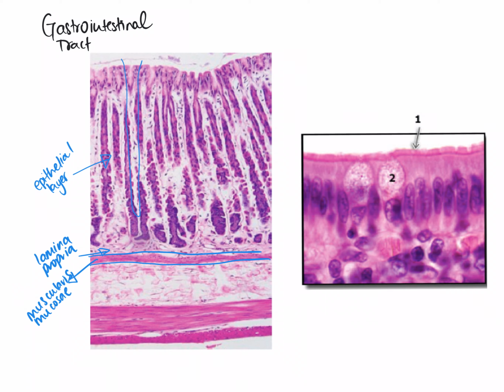Moving on from there, we've then got the submucosa, the paler layer that isn't as cell rich or as fiber rich, and finally, just before we reach the serosa down here, so let's label that first, the serosa. Finally down here we'll have the thick layer of muscle, so the muscularis externa.